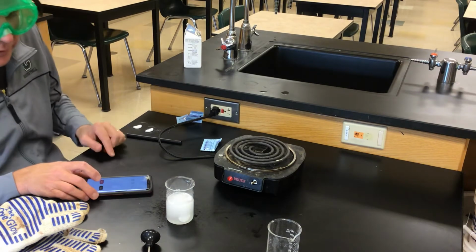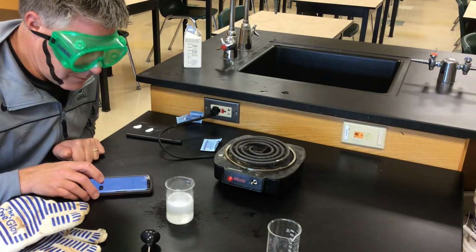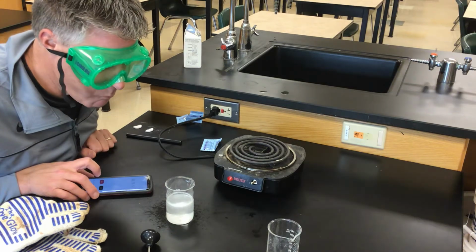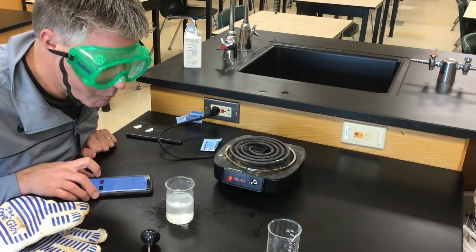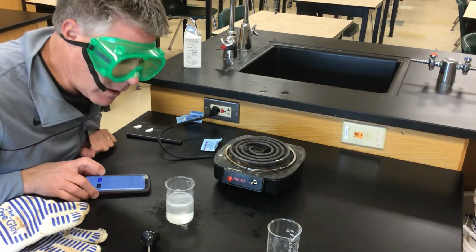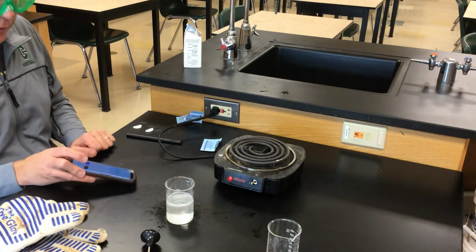Again, you can see it looks like it's going pretty fast. I'm kind of estimating when it's going to be done. Looks like about there. 24.01 is data point number 2.